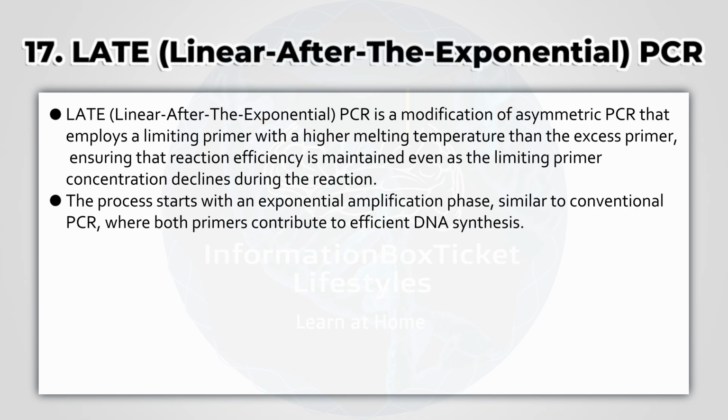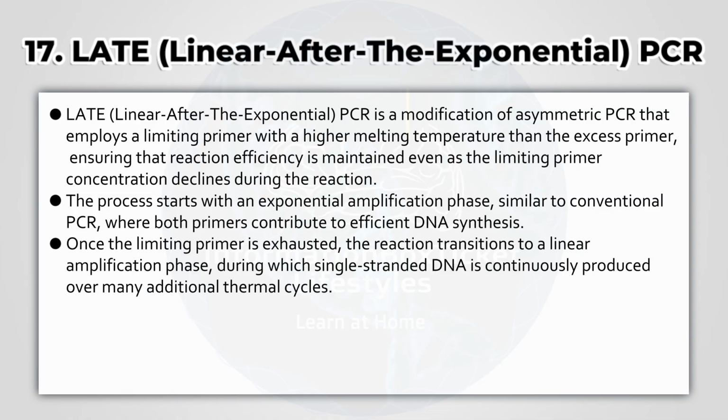The process starts with an exponential amplification phase, similar to conventional PCR, where both primers contribute to efficient DNA synthesis. Once the limiting primer is exhausted, the reaction transitions to a linear amplification phase, during which single-stranded DNA is continuously produced over many additional thermal cycles.